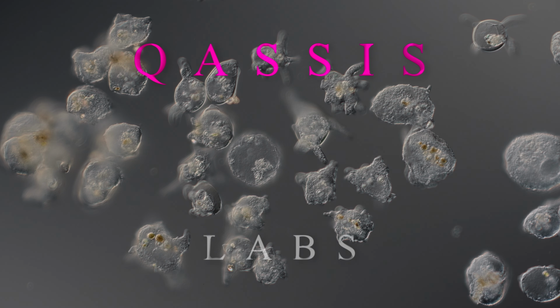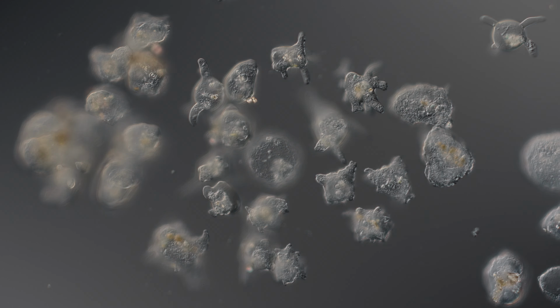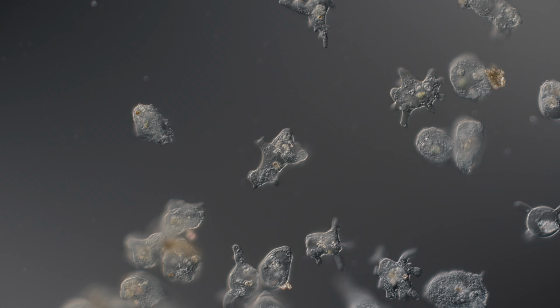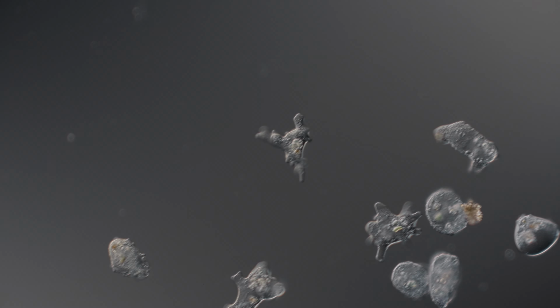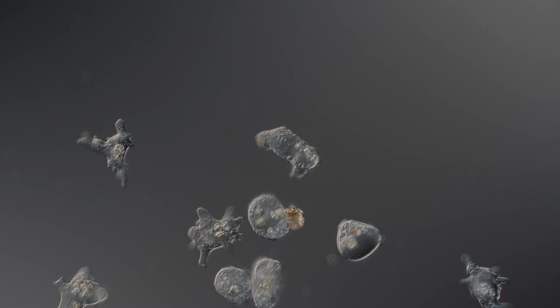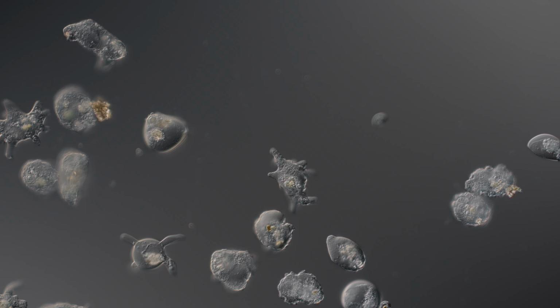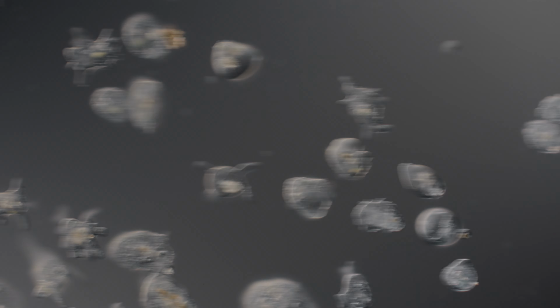Okay, I'm on the inverted now. We can see our beauties more clearly. So, here is a floating state, floating state, floating state. There are many forms in it. It's another floating state.